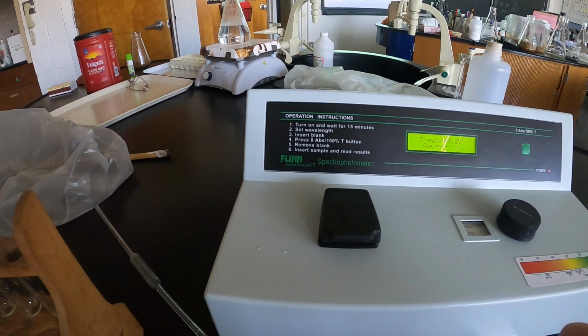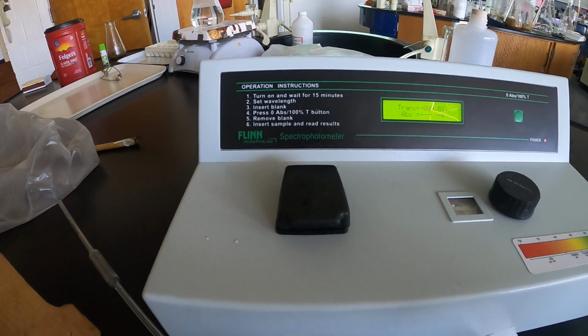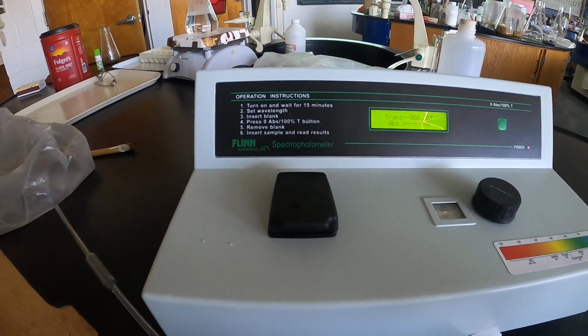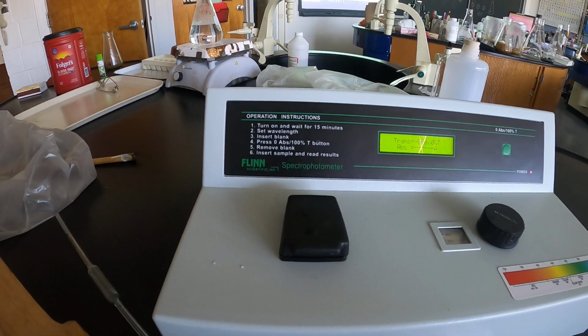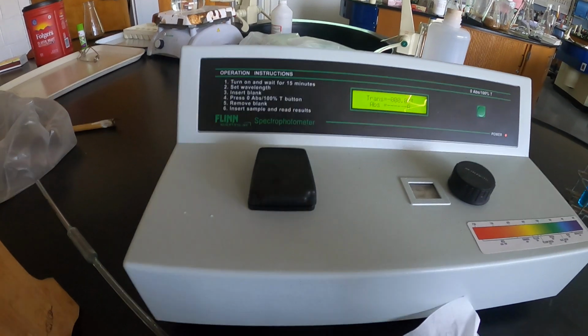Okay. Once you've documented the absorbance in all of your 5 standard solutions, make the calibration curve. But before you do any of that, certainly watch the other video that is part of the pre-lab and take the quiz. That's pretty much it. Good luck.